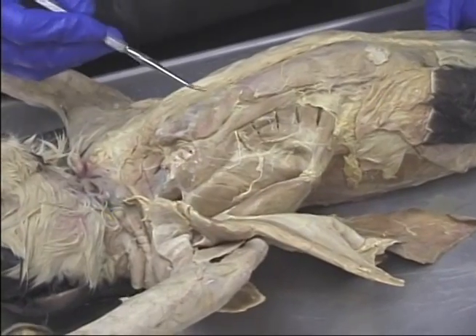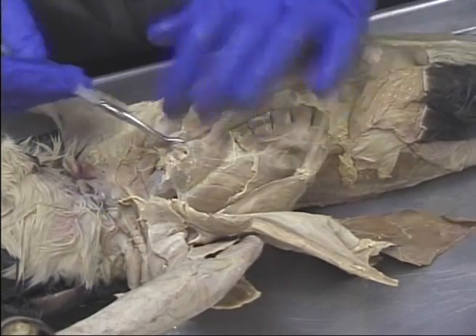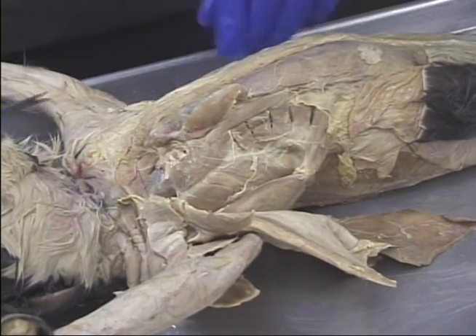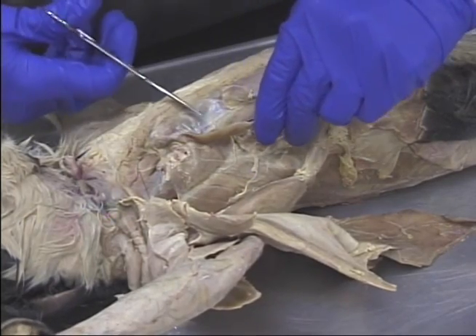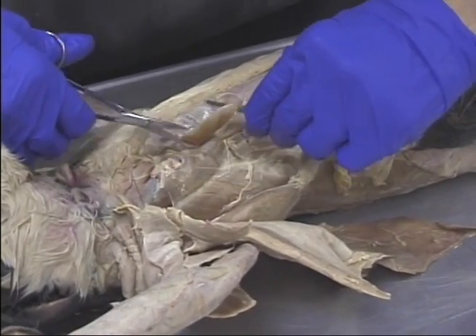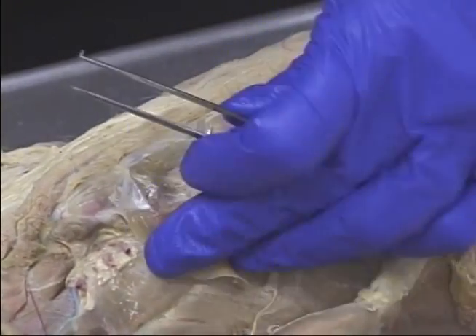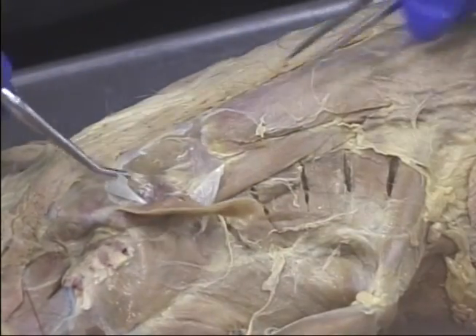Deep on the chest, here's the transverse costerum, which you may have cut out. Beneath it, we see the connective tissue that covers the external intercostal muscles. Let's remove that connective tissue from this specimen so you can see them better. See how nice and thick this fascia is. In between the ribs — one rib here and one rib here — you see the external intercostal muscles.